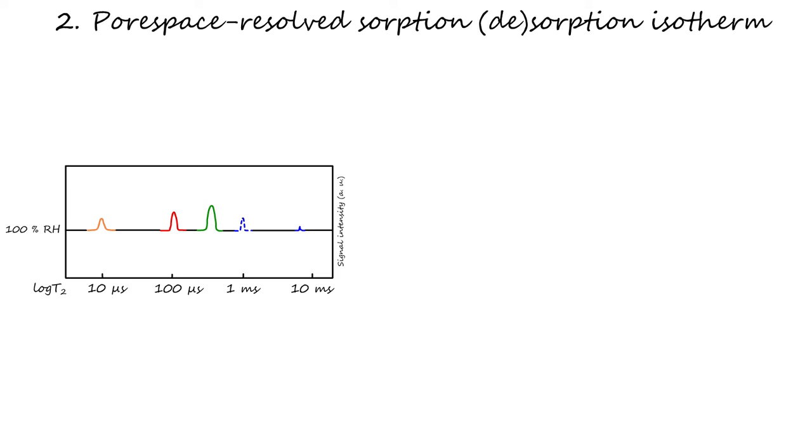The peaks observed in the spectrum are caused by hydrogens in different environments. The first peak can be attributed to those hydrogens bound in crystalline hydrates. We assume that for the white cement used here, these are only ettringite and portlandite.